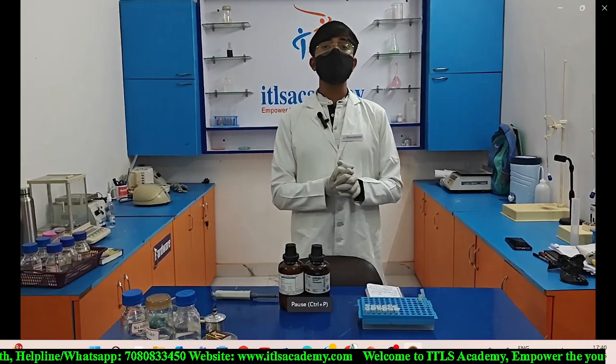So after performing the centrifugation, now I am going to discard the supernatant, and we need to carefully discard the supernatant so that the pellet should not be damaged. So after discarding the supernatant, now I am going to add 100 microliter of sodium acetate in each of the eppendorfs.